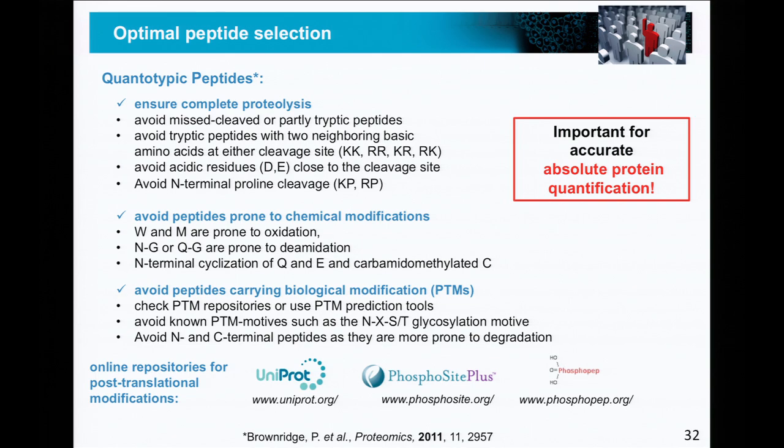And really the best way to address these things is always to work with one peptide more for quantification rather than one less. So rather go for 5 peptides for absolute quantification than start with only 1 or 2. Then you have no chance to figure out the outlier peptides from your analysis.